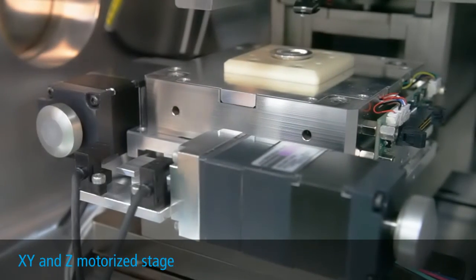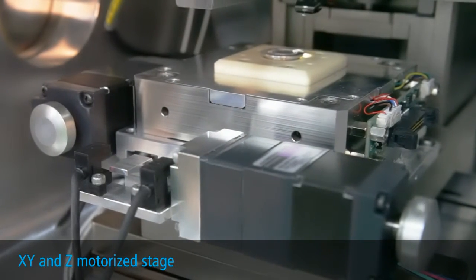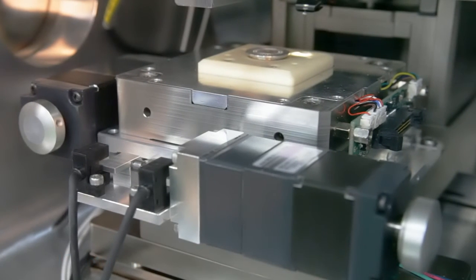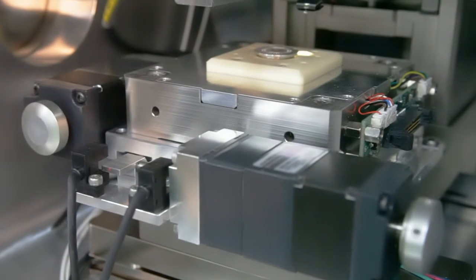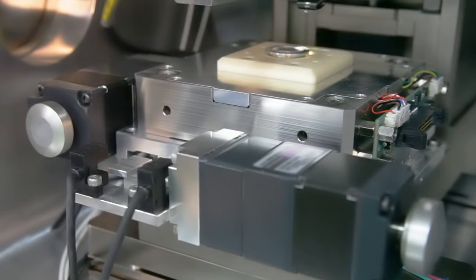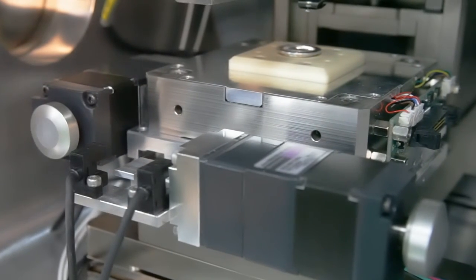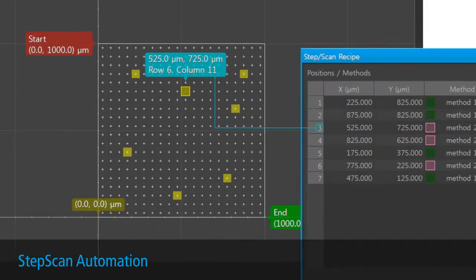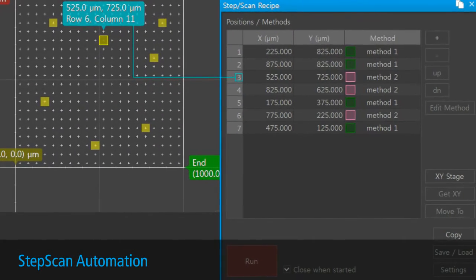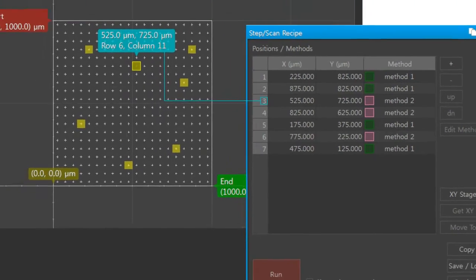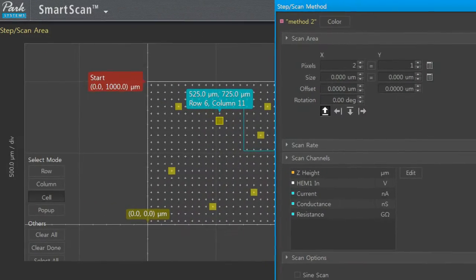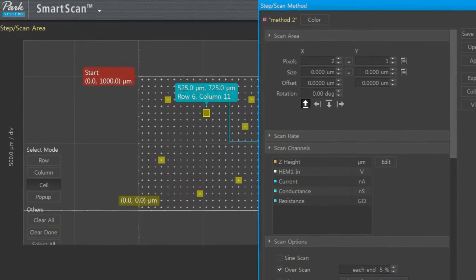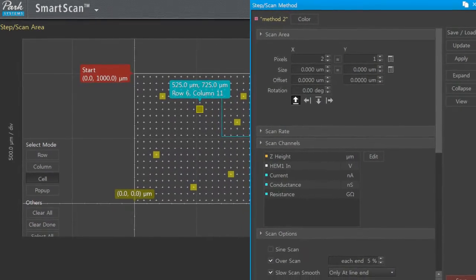Next, both the XY and Z stages are motorized. Their high-precision motors enable the user to move the sample and adjust tip approach via software without opening the chamber. Together, the motorized stages and the software step scan function enable automatic imaging of multiple samples via user-created recipes. This powerful ability allows multiple AFM images of a sample to be acquired and data to be collected, all without user supervision.